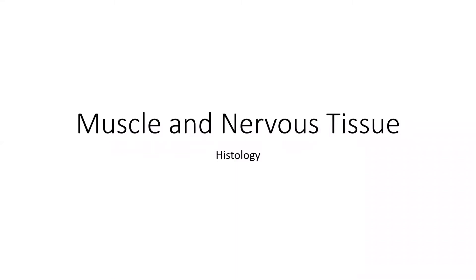In this video, we're going to look at histology slides of muscle and nervous tissue and go over how to identify different types.